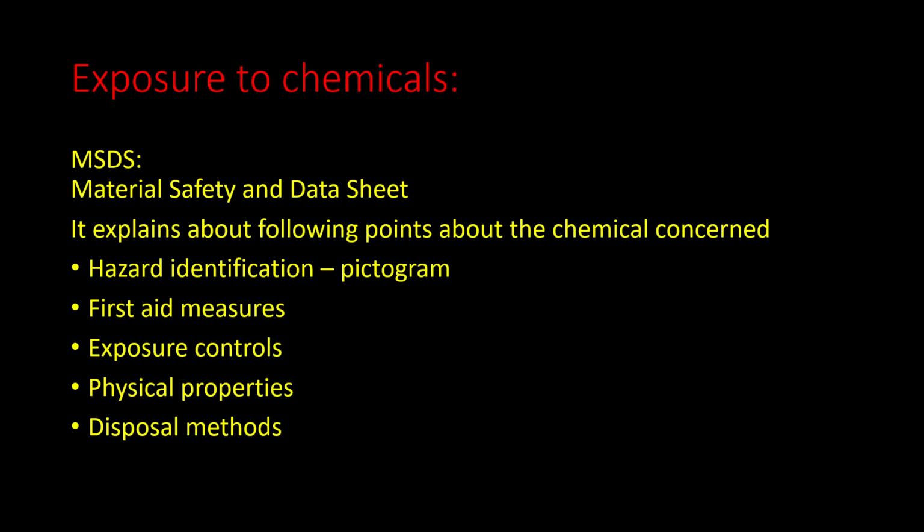You need to do a little bit of drill, you need to practice it, because the majority of the times when it actually happens, many people will miss steps or don't understand or try to do it without using the PPE. Such a thing should not happen. So you need to do the drill to understand it.